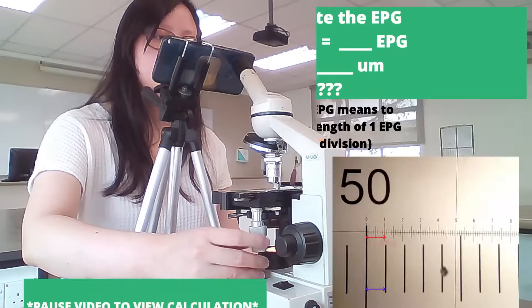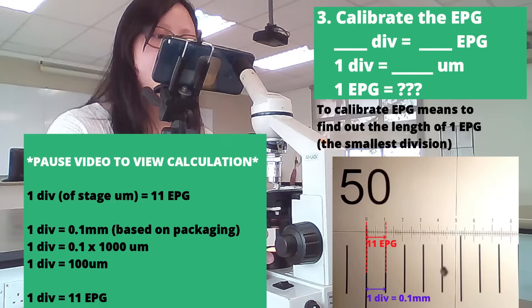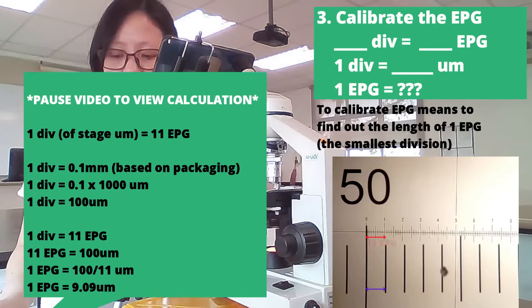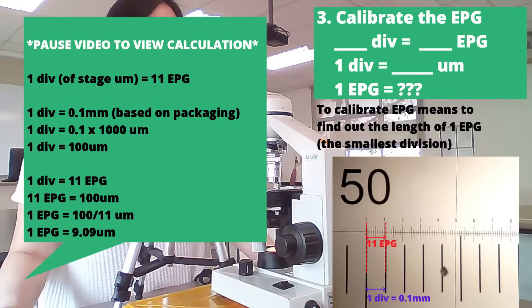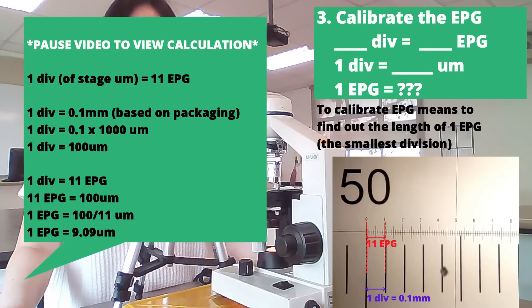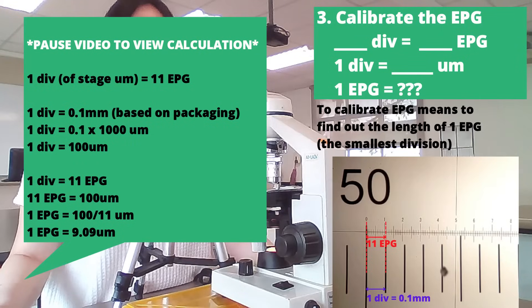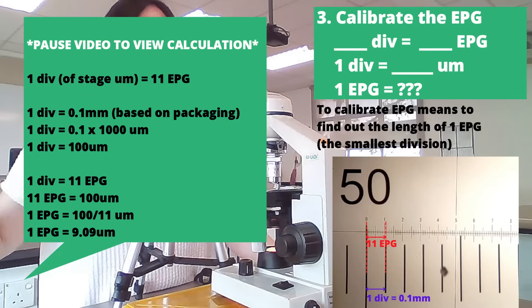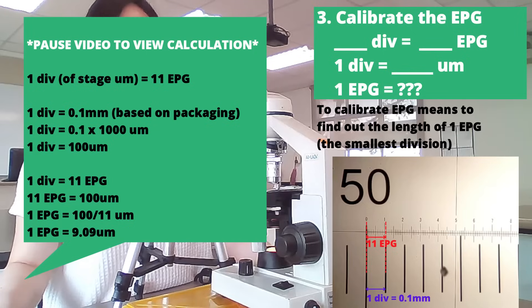Take a reading. In this case, it seems like one division on the stage micrometer, which is 0.1 mm, equals 11 EPG. Different microscopes will give you slightly different readings, and that is fine — each microscope has some error. So 0.1 mm equals 11 EPG, and we can use that to calculate the length that each eyepiece graticule division represents. The eyepiece graticule is labeled 1, 2, 3, 4, 5, 6, but when we talk about 1 EPG, we are talking about the smallest division on the eyepiece graticule — that's very important.